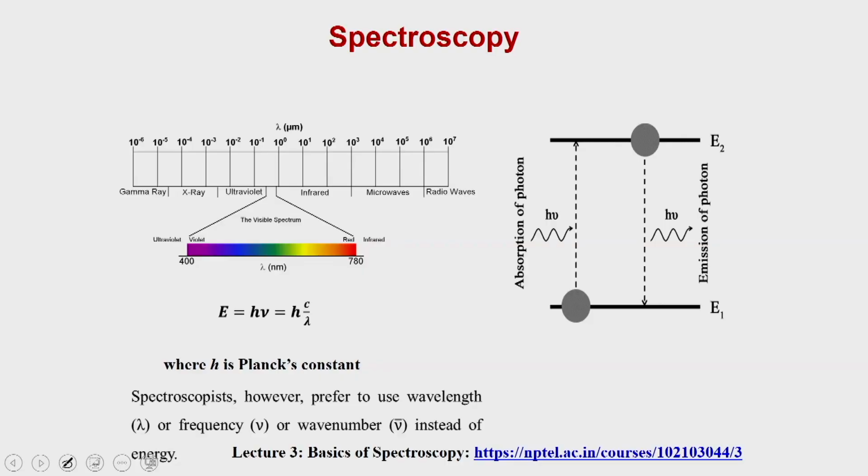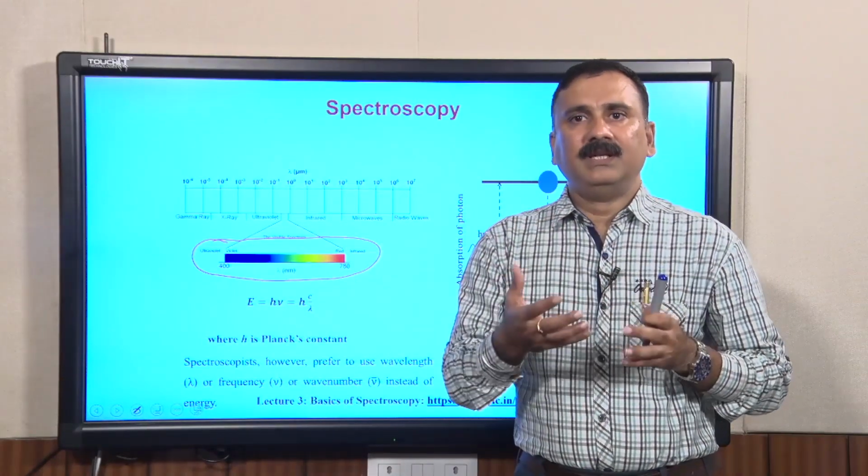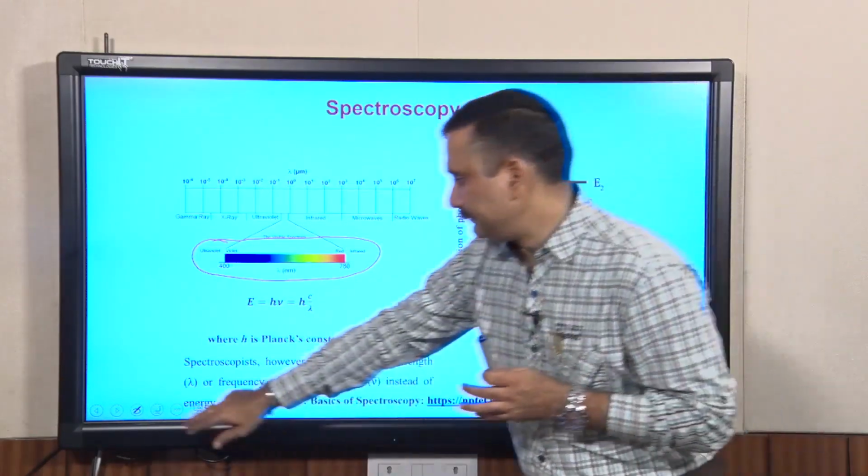So, this is what we were discussing about spectroscopy. We started with UV visible spectroscopy in the previous lecture, and what we said is that UV visible spectroscopy is sensitive to the electronic transitions within the molecules. Now, in today's lecture we will see how the electronic transitions can be used even to map the perturbation, or the structural changes, in the molecule.